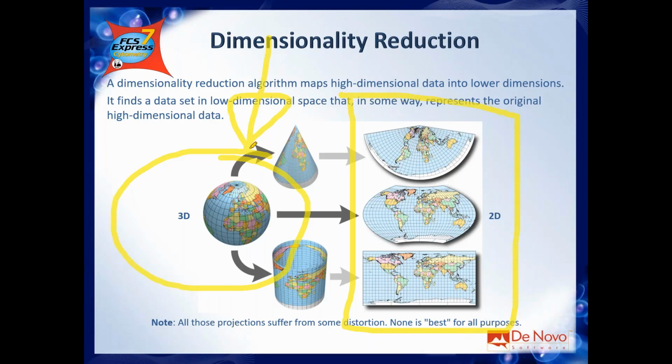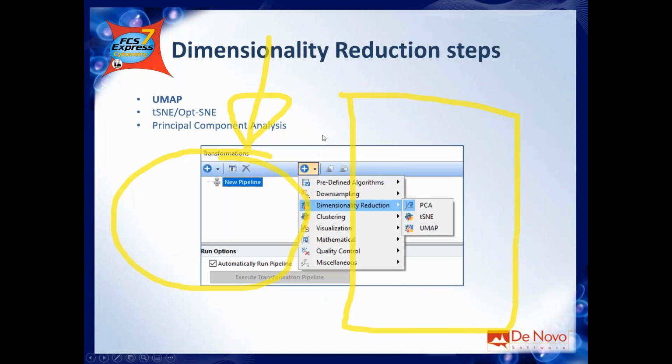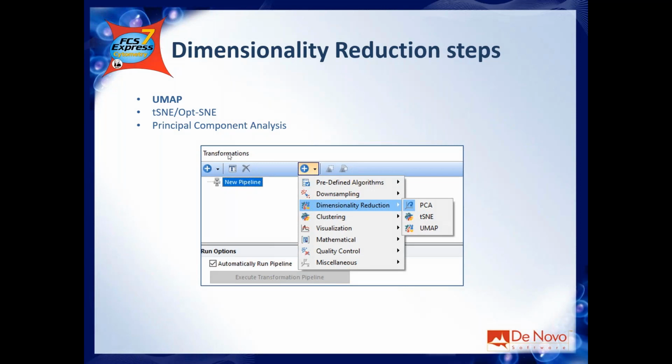As an example, I want to show you UMAP. Not because it's the best, just because it's one of the available, and it's definitely the most recent between them.